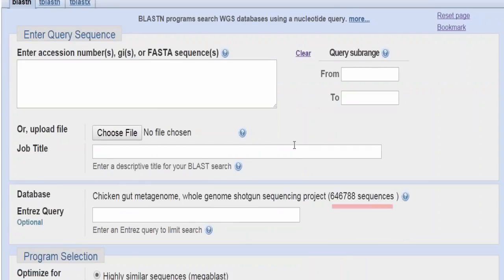And you can see that this is basically a whole bunch of WGS contigs. They're not assembled, and that makes sense because these represent multiple organisms. In some cases, people make scaffolds out of these kinds of things. And what I'm going to do just to show you is a particular kind of sequence that's useful, and that's one of these 16S sequences from one of our targeted loci projects.